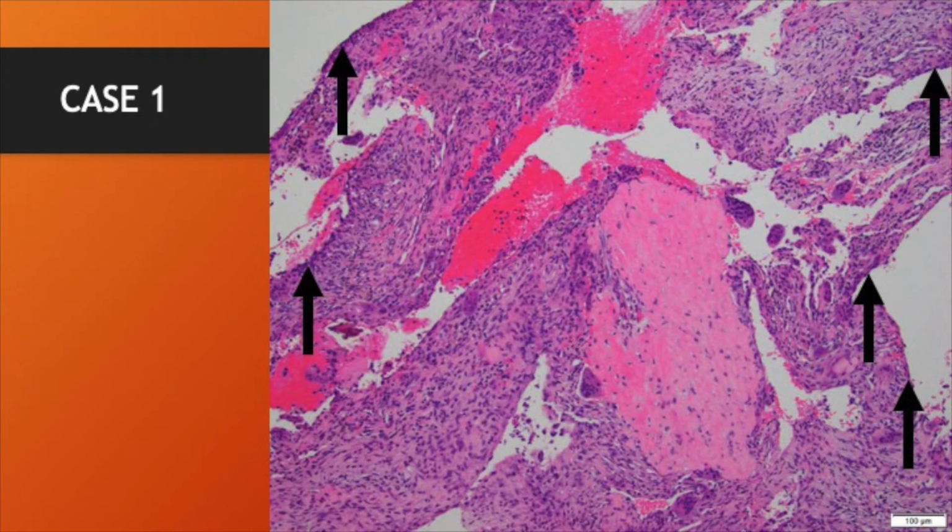Well, at first, when you look at this, you might say, well, there are tons of cells present, so that's what we're going to go with. But I've highlighted here where you have a lining. You can see those cells get thinner and denser where there's a very clear lining directly adjacent to this blank space. So you have to be very careful which part of this algorithm you start to choose. There is a clear lining to this space, and that's what all these arrows are demonstrating. So you have to be able to recognize that. You have to look at the blank space and see, is there a lining directly adjacent to it? And the answer here is yes. So even though there are a lot of cells here, there's more to it than that, and this is a lined cavity of some sort.